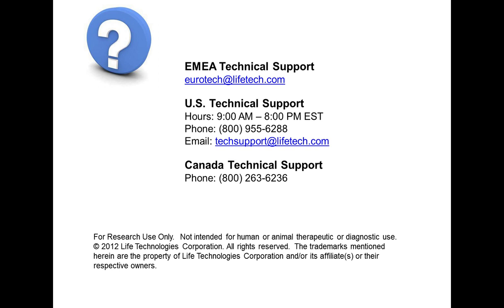By exponential display, there are 3 different types of scales. There is a linear scale, there is an exponential or logarithmic scale, and then there is a newer bi-exponential scale, and this is a combination.